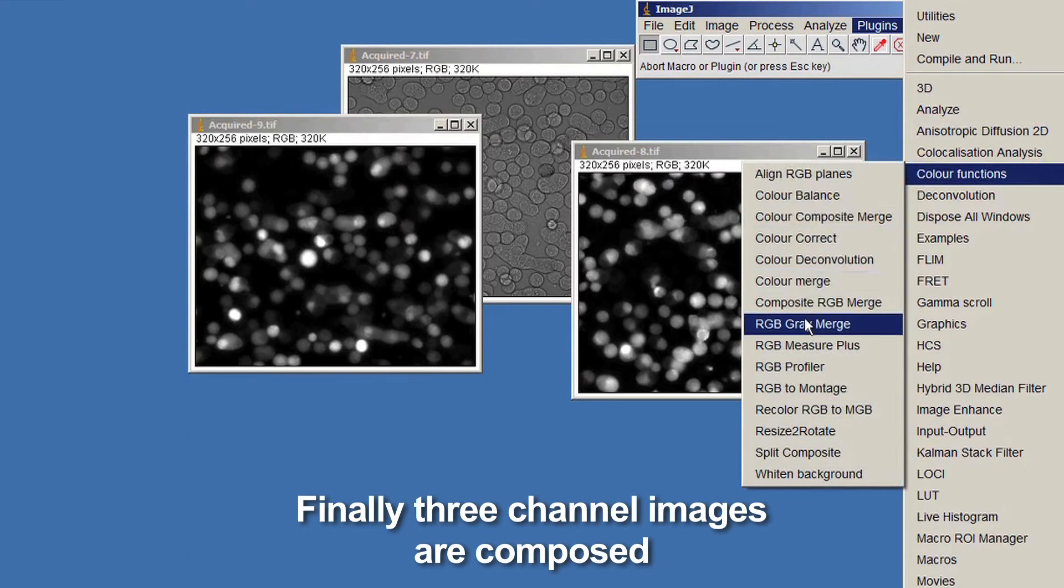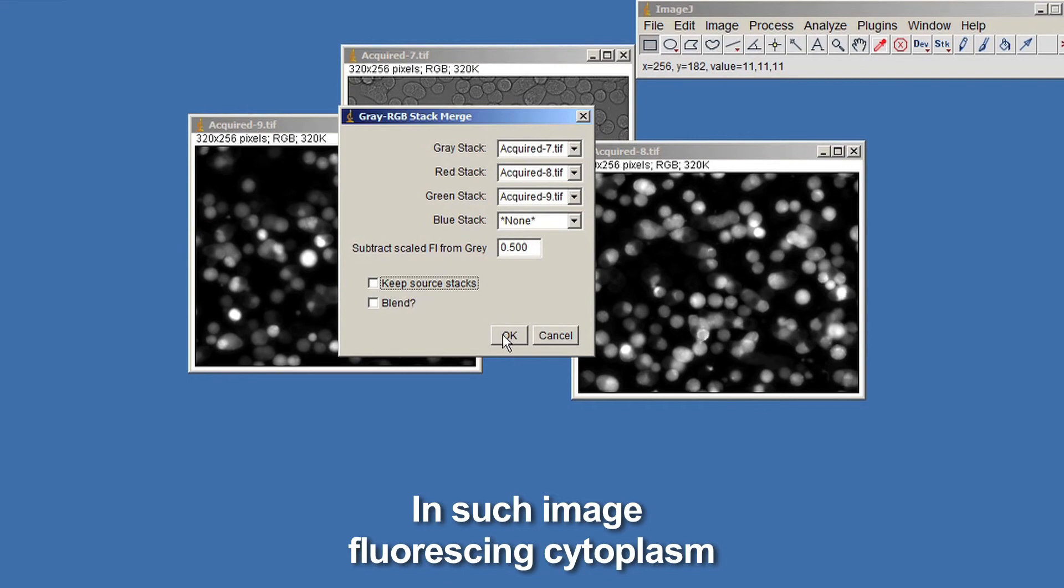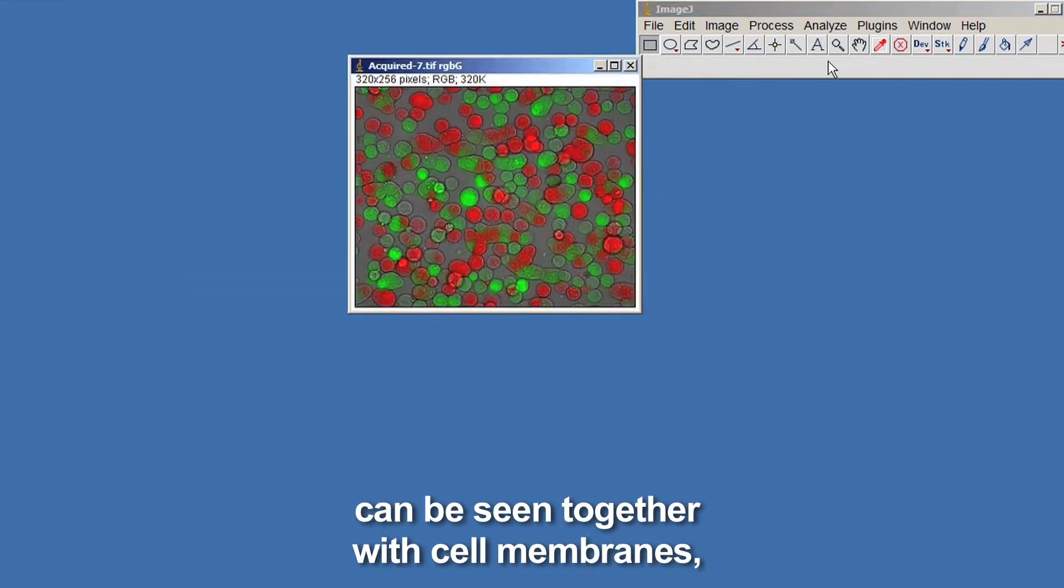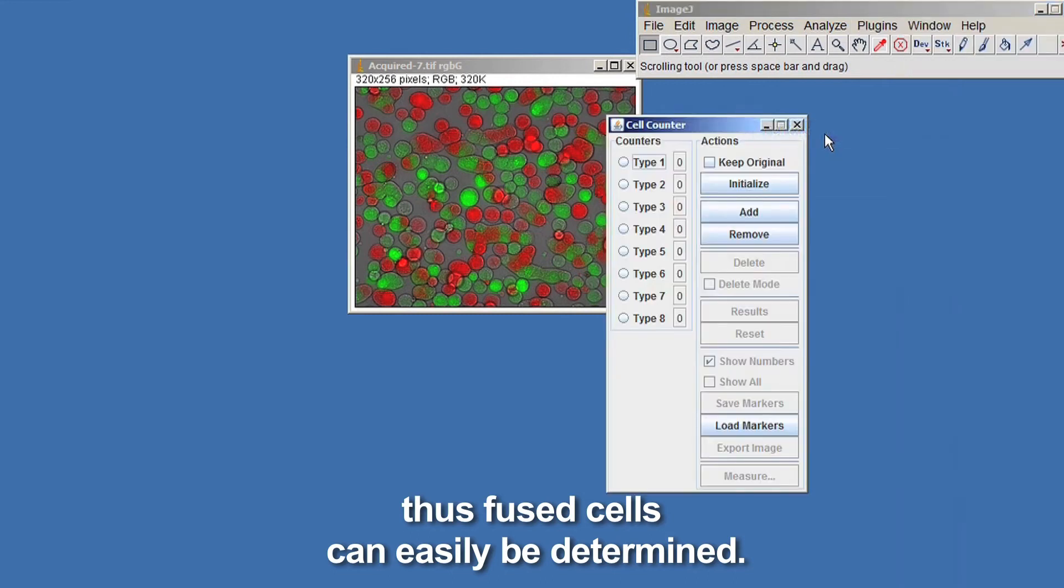Finally, three-channel images are composed using RGB Gray Merge ImageJ plugin. In such image, fluorescing cytoplasm can be seen together with cell membranes, thus fused cells can easily be determined.